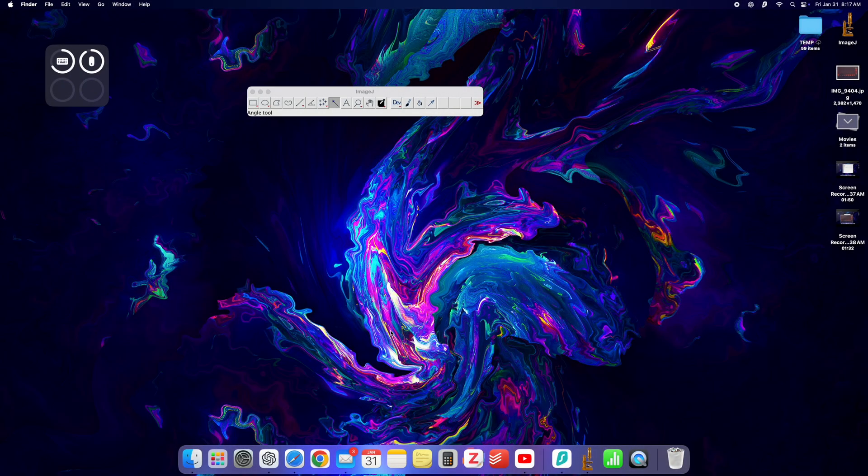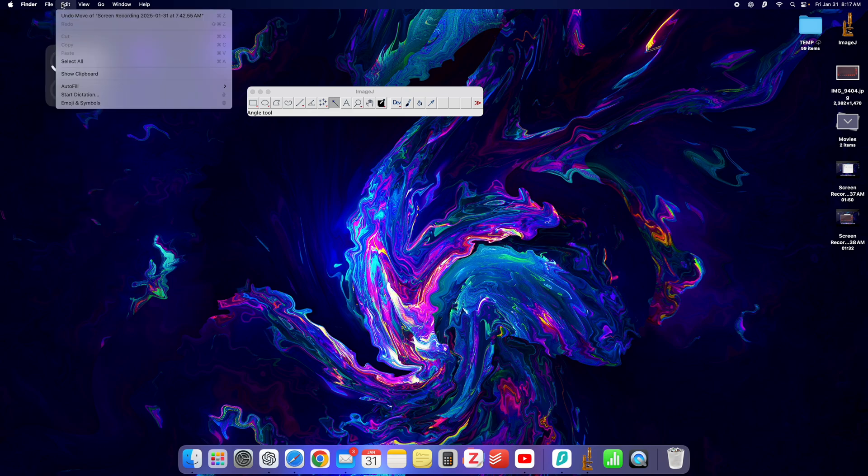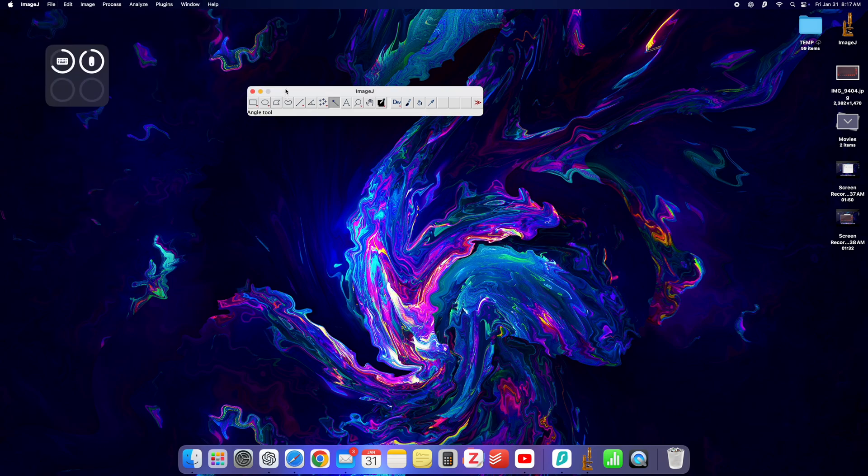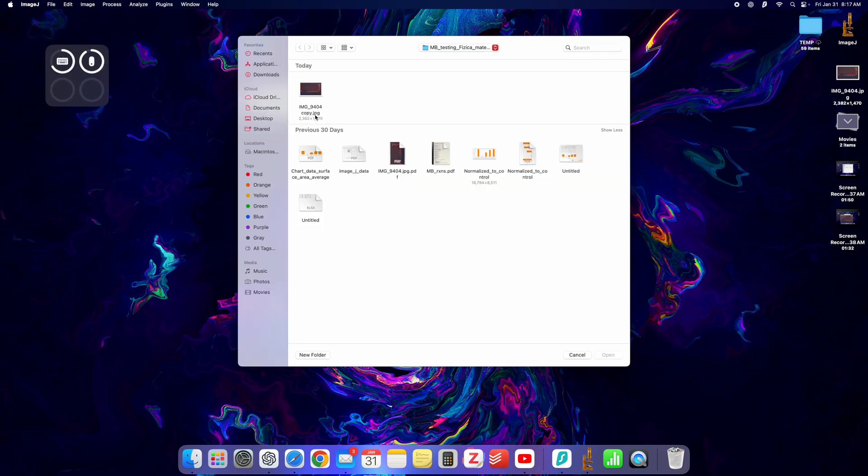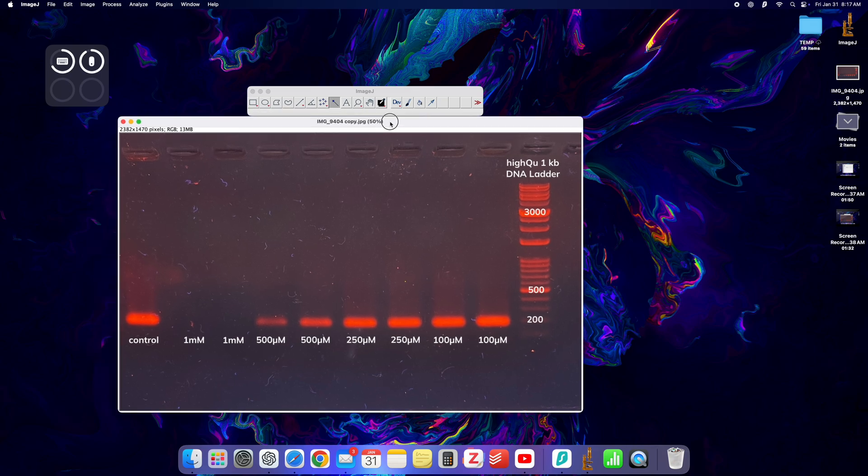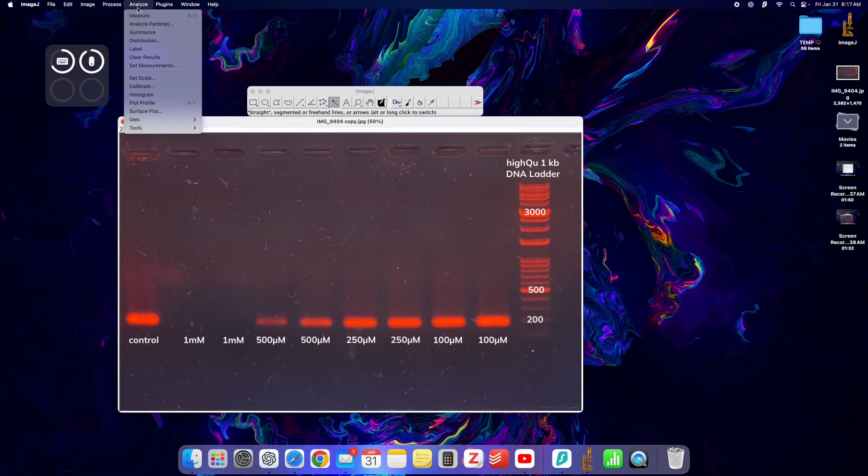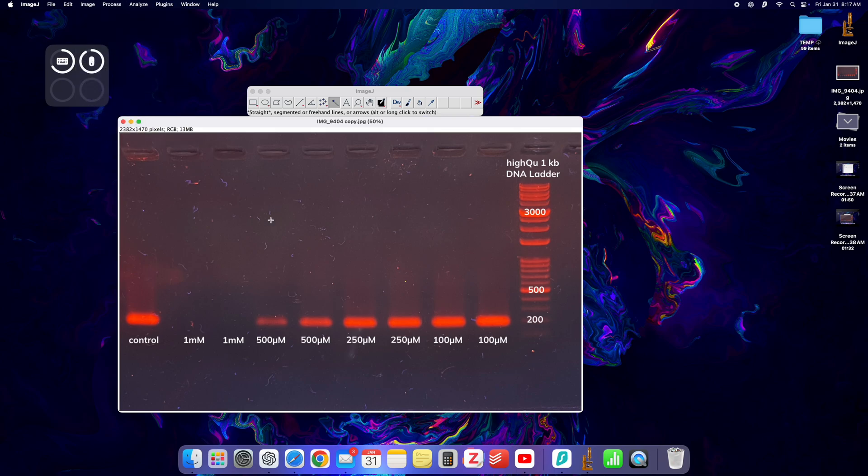Now first of all you will need of course the ImageJ software installed, then we'll go to file open and I'll open my image right here. Next I would want to convert this to 8 bits.